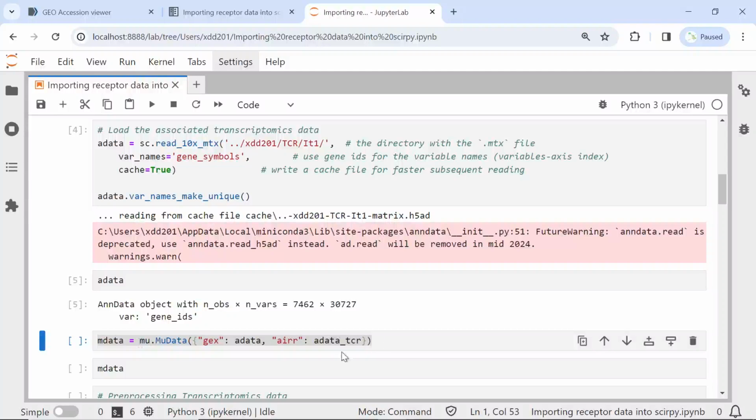If you use the older Scirpy package, they save the TCR sequencing data information in the AData observations. But now we save the TCR sequencing information as a separate data array, the immune receptor repertoire.